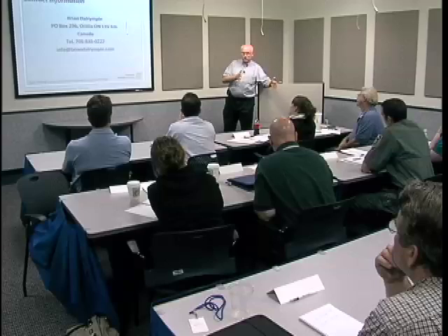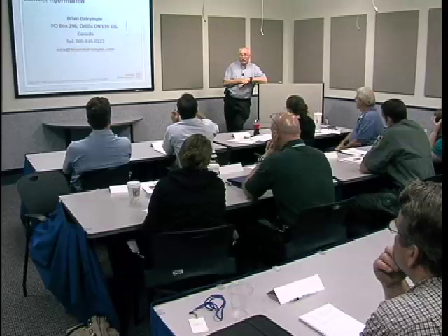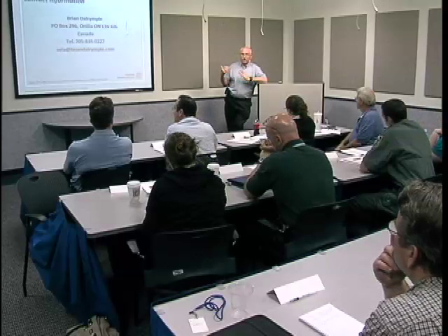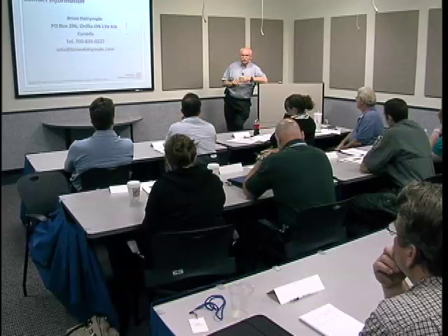But to my knowledge, there was no formal quantitative study done between what was available through untreated detection versus with lasers versus forensic light sources. Everything that I saw on the subject till about 5 years ago was totally anecdotal. You'd say, well, I found something with a laser, I didn't see it with a light source, and the other person would smile and nod their head. Very difficult to quantify, as I say, because it hadn't been done before.